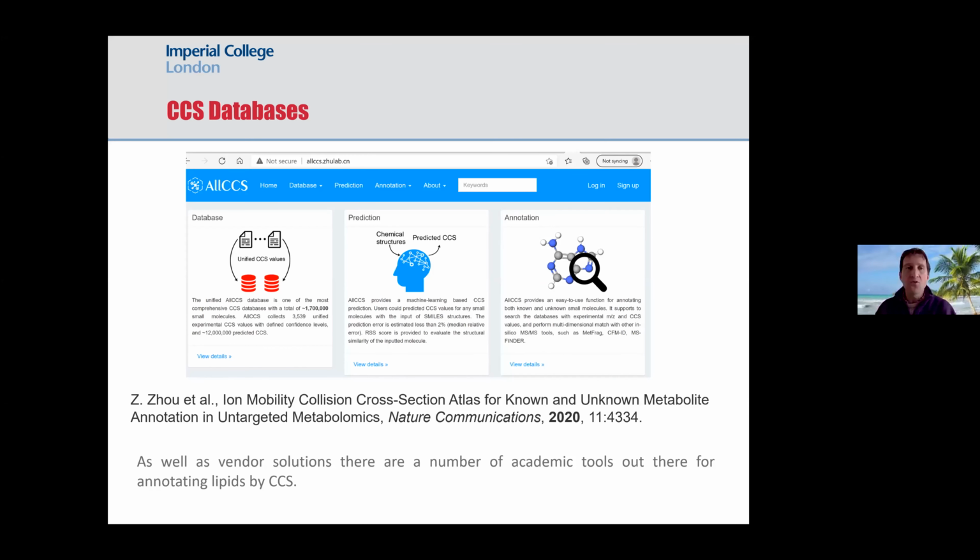So I think I'm on the home straight now in terms of ion mobility. I've got a single slide here on CCS databases. The CCS databases probably warranted slightly more slides, and there are a number of these. But the point I wanted to make is that you can now generate these collision cross-section values in silico, and they're very predictive for the ones that we measure in terms of our ion mobility. Indeed, you can get accuracies of 1 or 2% in terms of these CCS values.